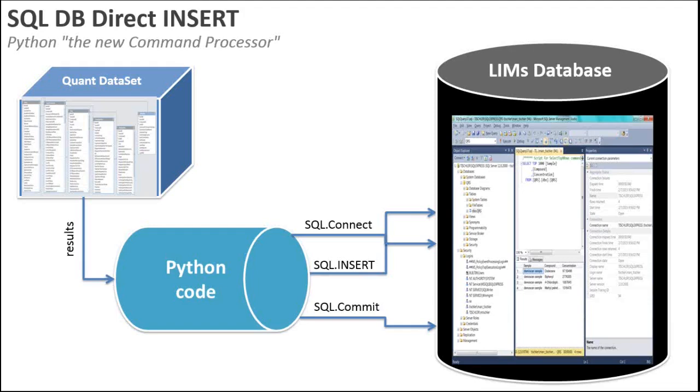I see that we're going to use Python, which is the most popular language now, and all the folks coming out of engineering school are being taught Python. Python code, things today are easier, and this is part of this technology revolution that I'm talking about. So let's say that you do have your LIMS database and you have an SQL database, very common.